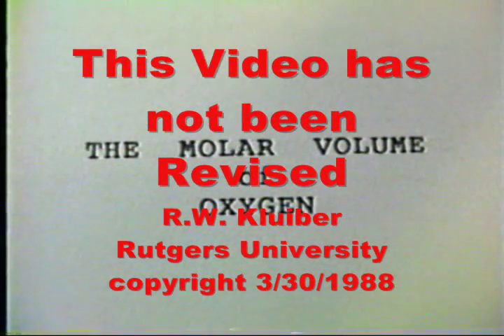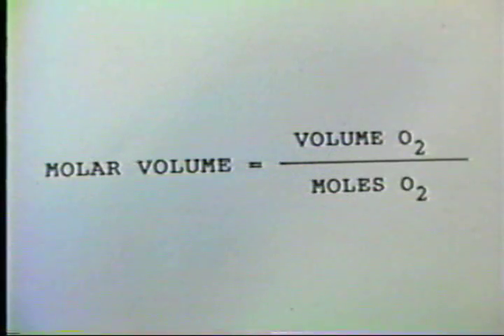In today's experiment, we're going to determine the molar volume of oxygen. Molar volume is defined as the volume occupied by 1 mole of gas. It's usually given at STP.